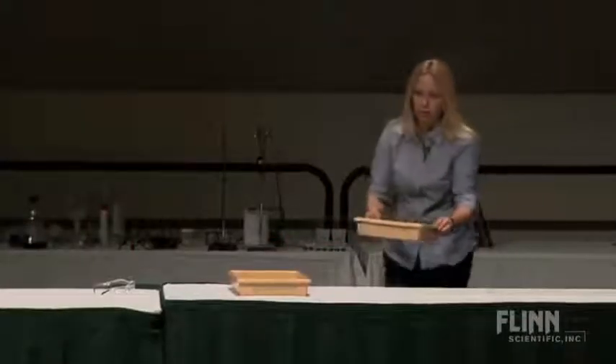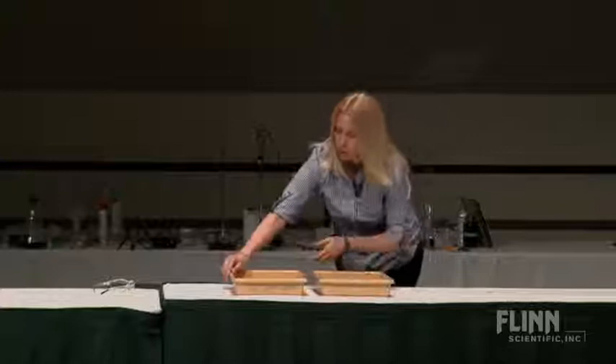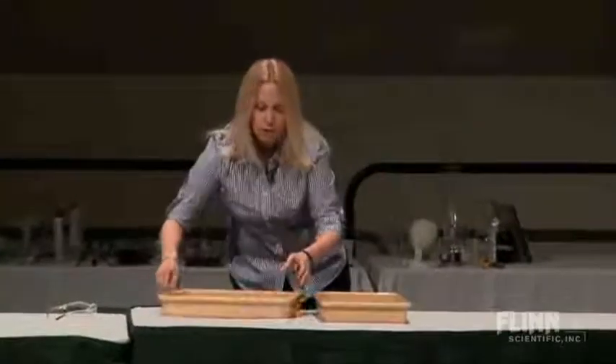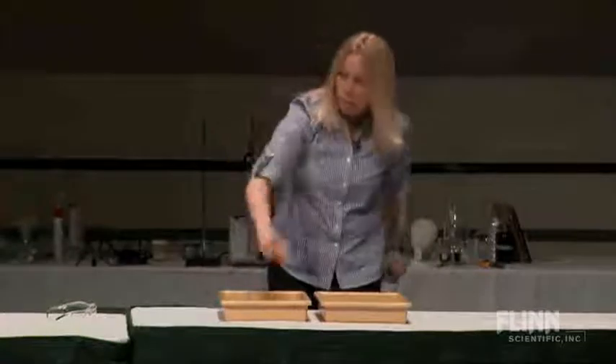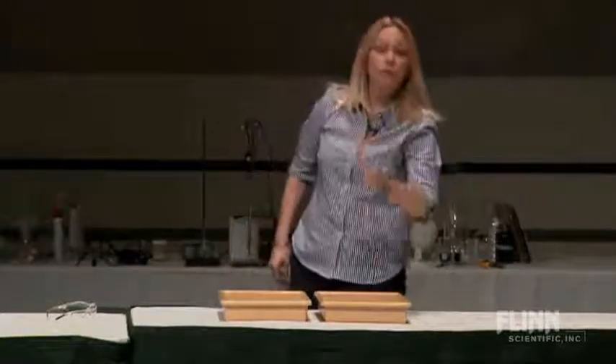I actually am probably more of a frustrated artist than I am a chemist. These are not well plates — you can tell I got them out of my lab. What I have up here is regular water and 3% peroxide diluted to about 75%.